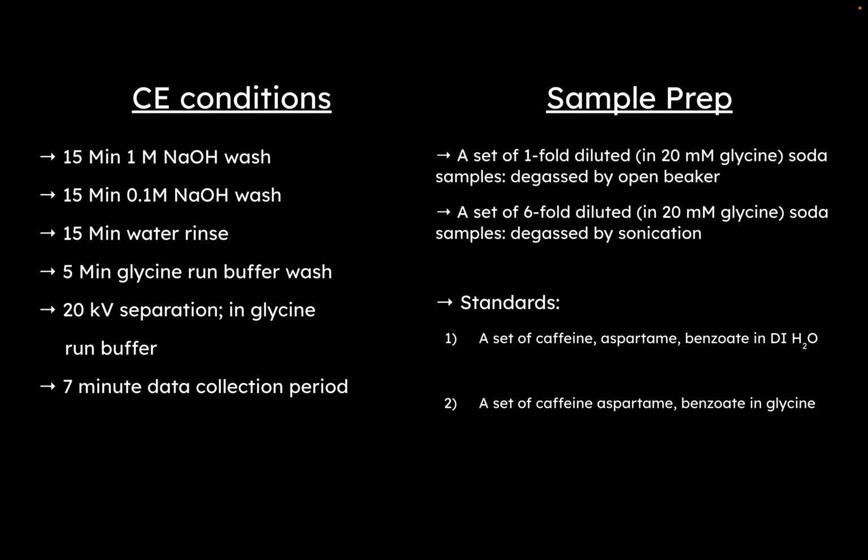Okay, so the conditions that they call for are very rigorous. Now, they say that for every sample, you have to do a 15-minute sodium hydroxide wash, a 15-minute 0.1 molar NaOH wash, a 15-minute water rinse, a 5-minute glycine buffer wash, and then you inject your sample, and then it's a 20 kilovolt separation. It is very tedious and, quite frankly, inefficient. From an analytical standpoint it's good, but in an industry application, this is just not great.